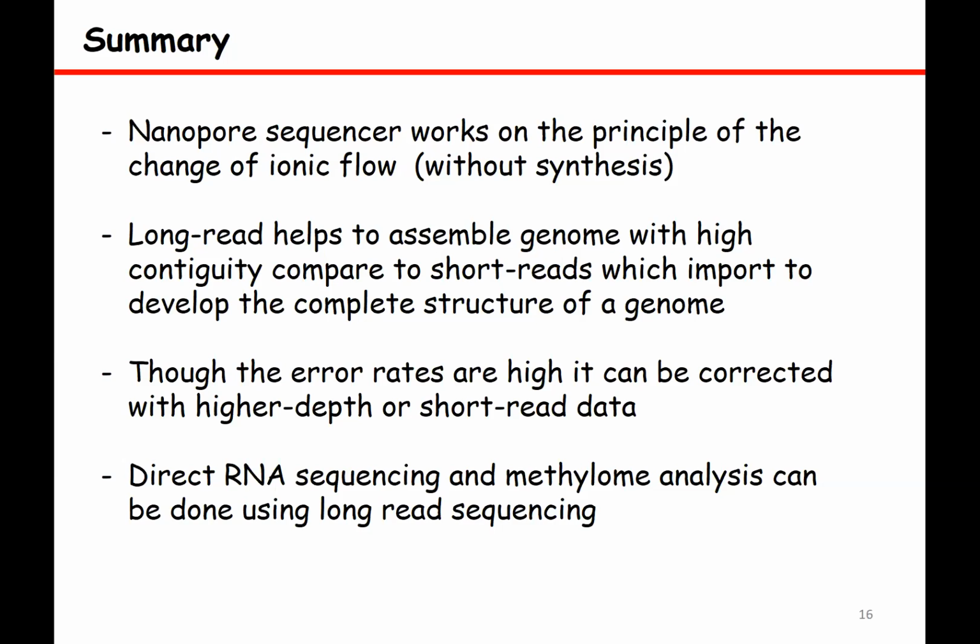Direct RNA sequencing and methylome analysis are really a plus for nanopore sequencing. So I definitely suggest that whoever is getting into sequencing technology, this is a really good technology to use. Nanopore technology is not only for the whole genome. You can also do PCR sequencing or sequence enrichment analysis. It's also multiplexing. There has been technology for high throughput genotyping. It's still on the road.